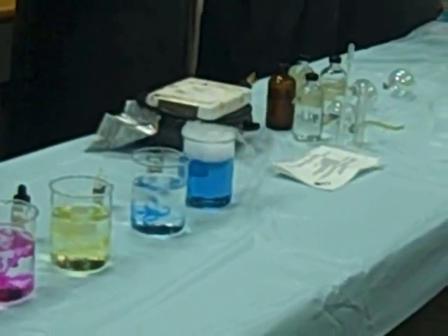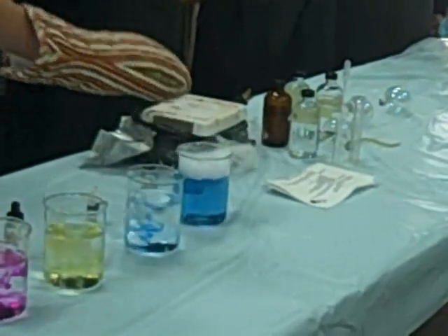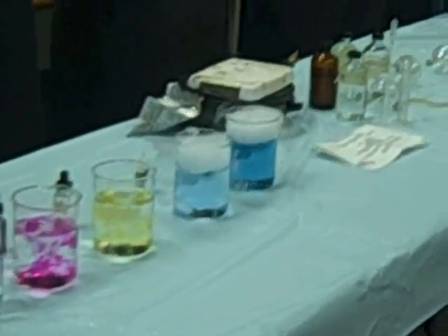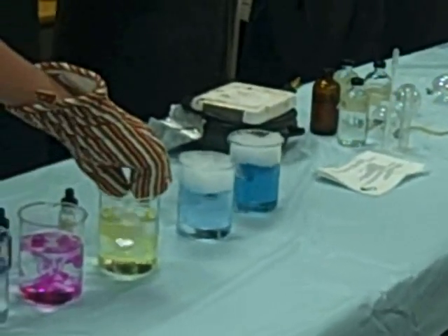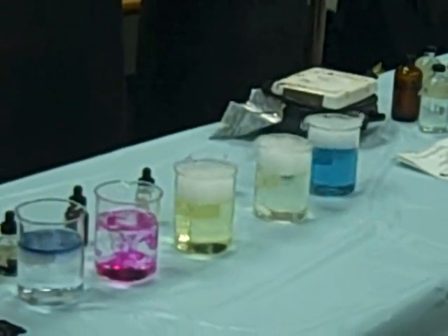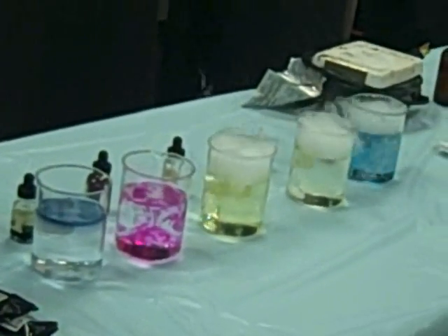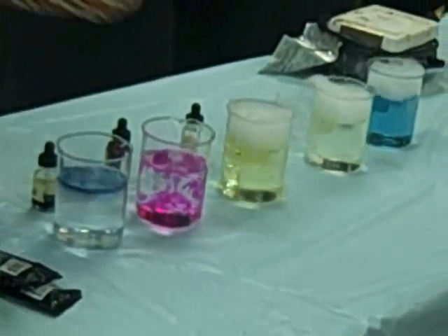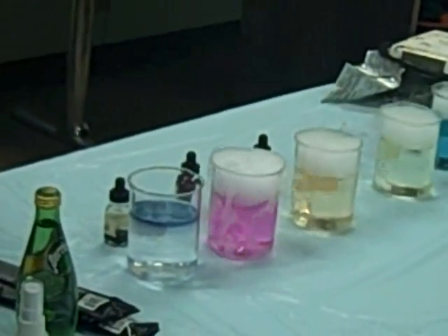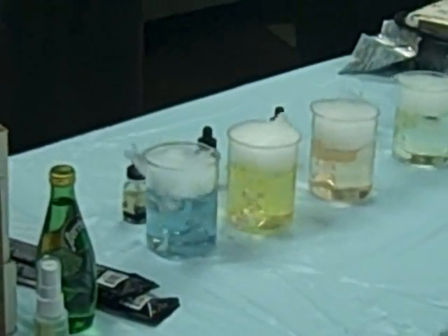This is the dry ice dissolving. This one's changed colors.